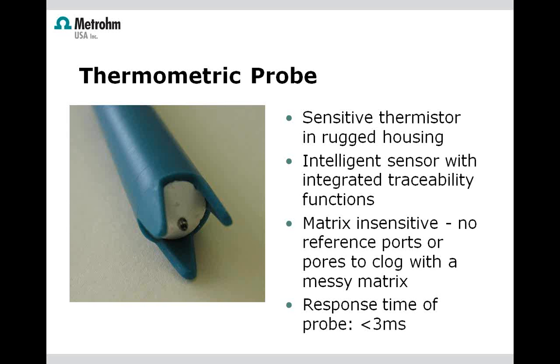So when compared with a potentiometric titration probe, for example, a typical electrode, when used in difficult matrices, we're normally concerned about clogging of the diaphragm, but that is not a concern when dealing with the thermometric probe, as there are no openings, no pores to be clogged.